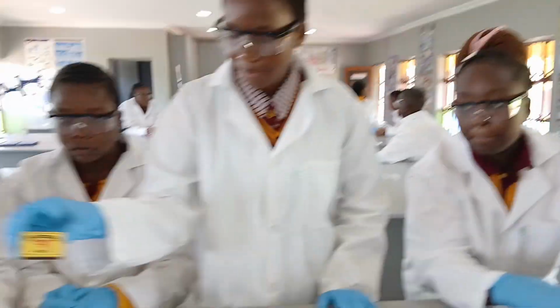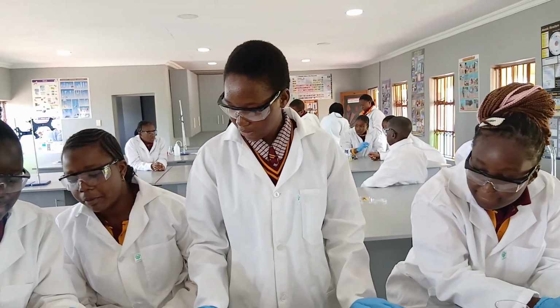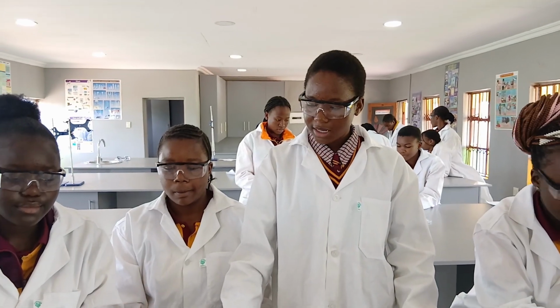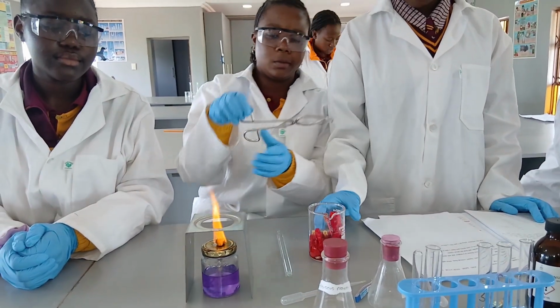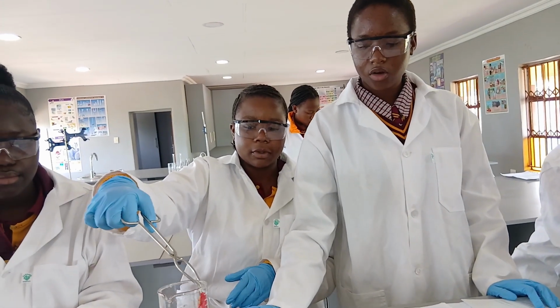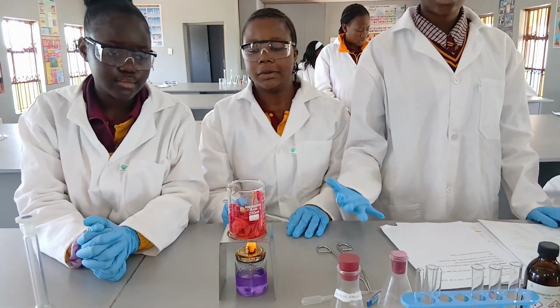And we're going to light up the fire. And then we're going to place it under our spirit burner stand. Then we're going to put our solution on top of the spirit burner stand, which we will name our hot plate, and let it burn for about 5 minutes. Then we can extract the color of the hibiscus flower to make our own indicator.